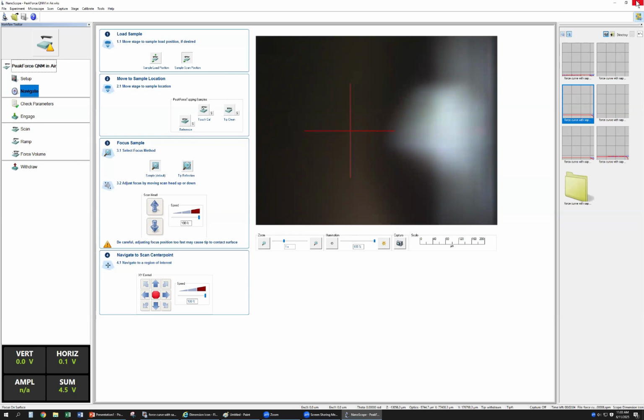So the number 3 code name is poly, oh, I cannot see clearly. And this poly opcon. This may be a little bit hard polymer. Okay. I don't really know what the material for this sample is.